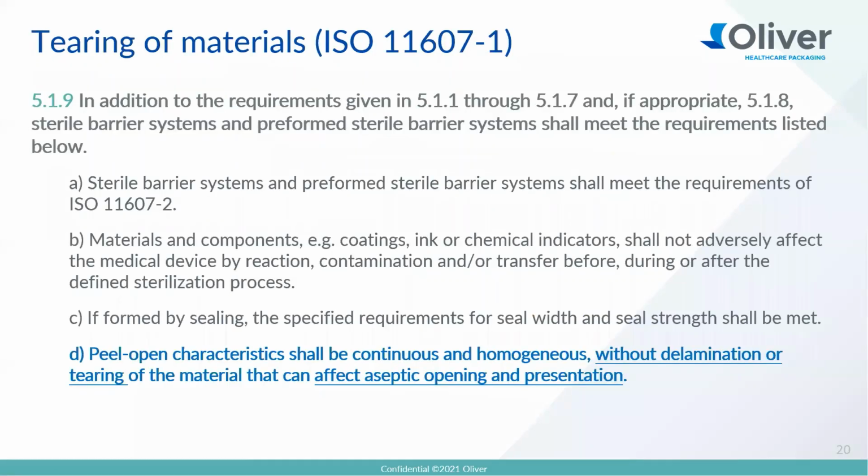Yeah, Jeff, this section is, for me, an interesting one because, in the past, I've been contacted in the EU with questions around delamination and tearing of materials, and that it's a big no-go from a customer perspective. Jeff, what's your perspective of it?